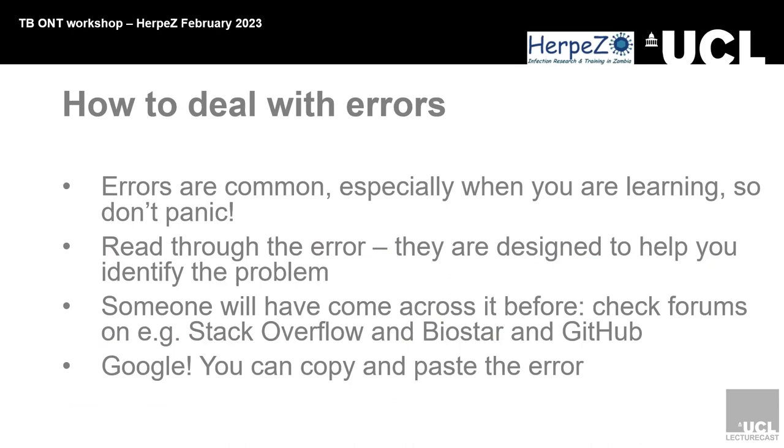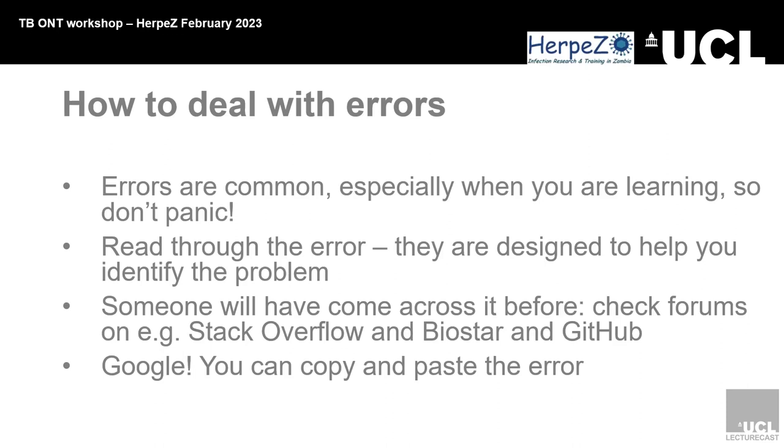How to deal with errors: Errors happen all the time, especially when you're learning, so don't panic. Read through the error, they are designed to help you identify the problem. Someone will have come across it before, so check forums like Stack Overflow, Biostar, and GitHub. You can Google the error codes. You can copy and paste the error. There's also an online Nanopore community where you can post error codes and ask people what they mean, and people will respond to you.